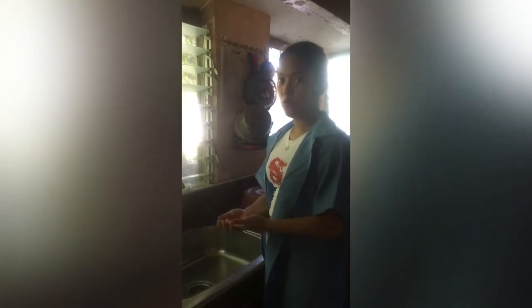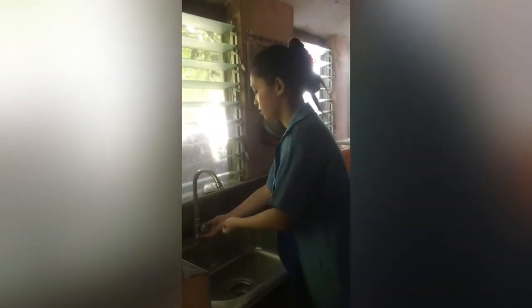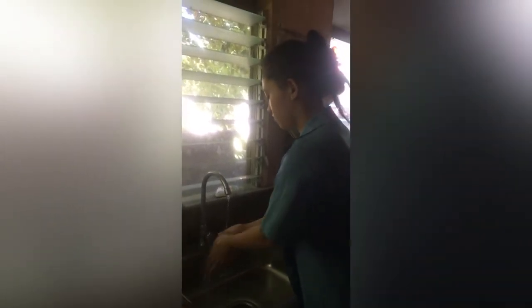So before we dissect, let us first wash our hands. So now that I'm done washing my hands, now we can proceed to dissecting.